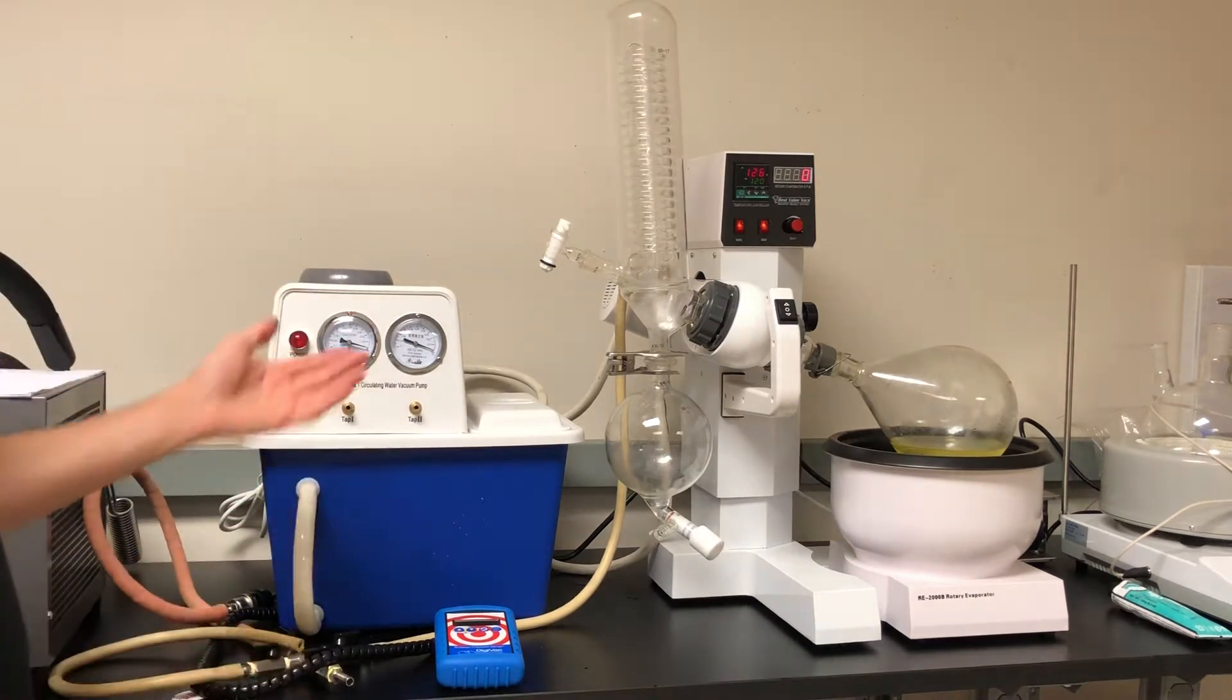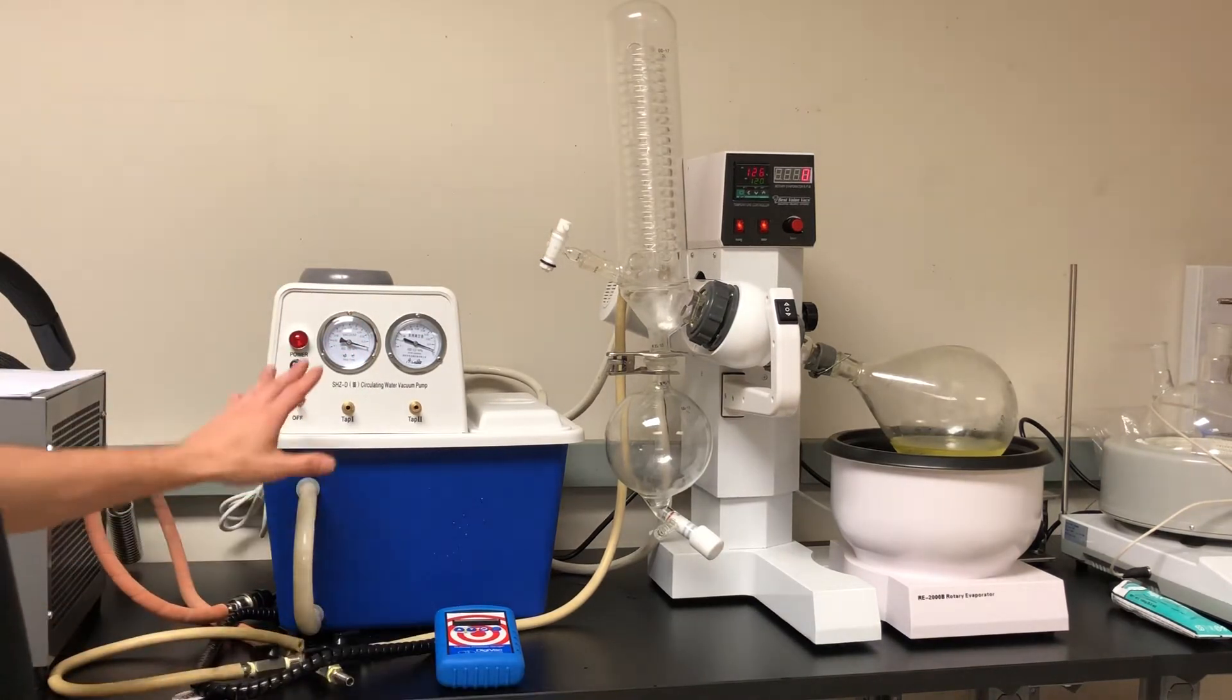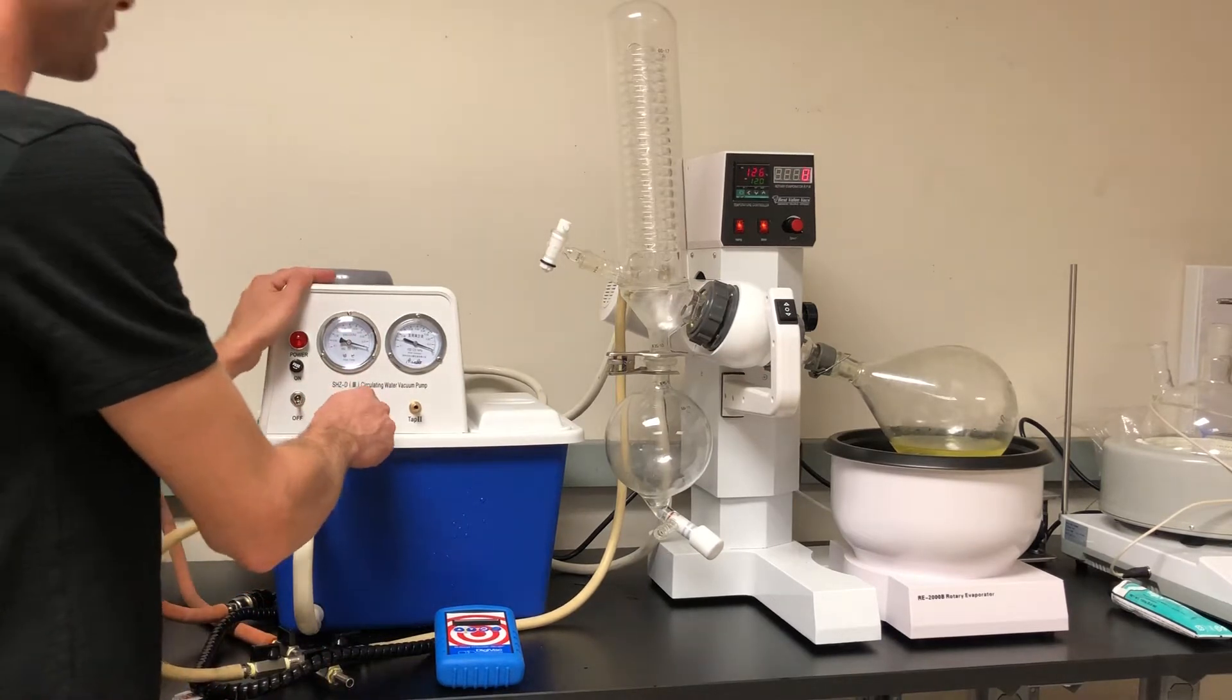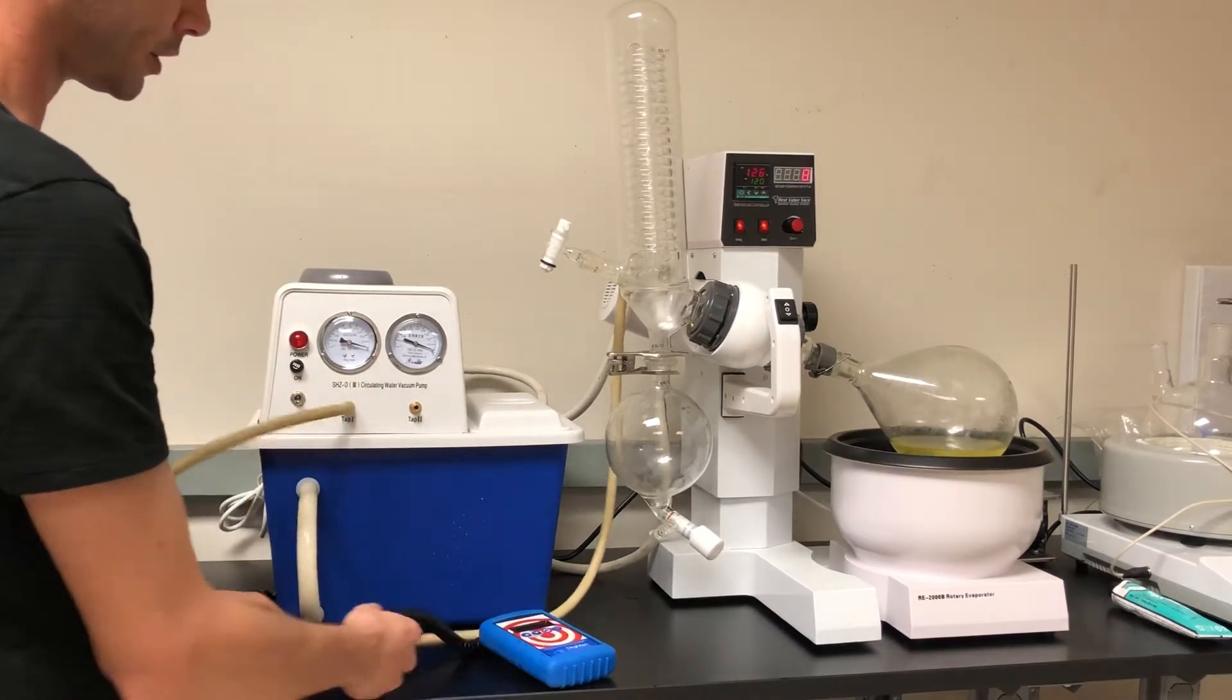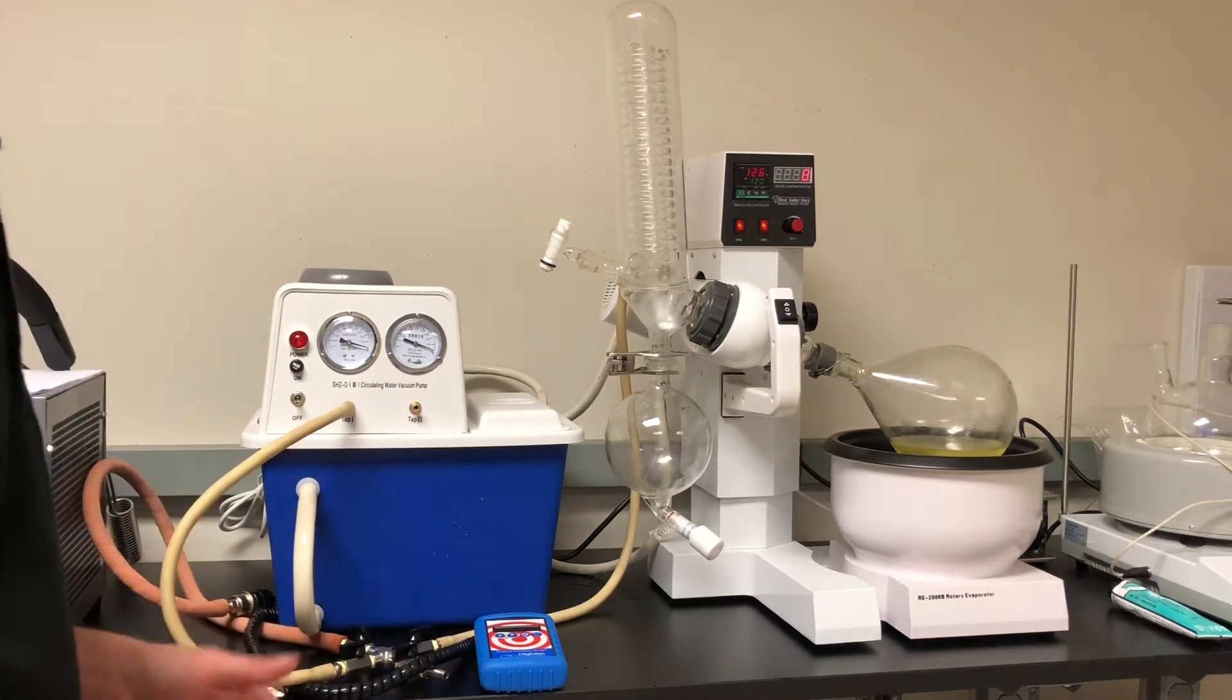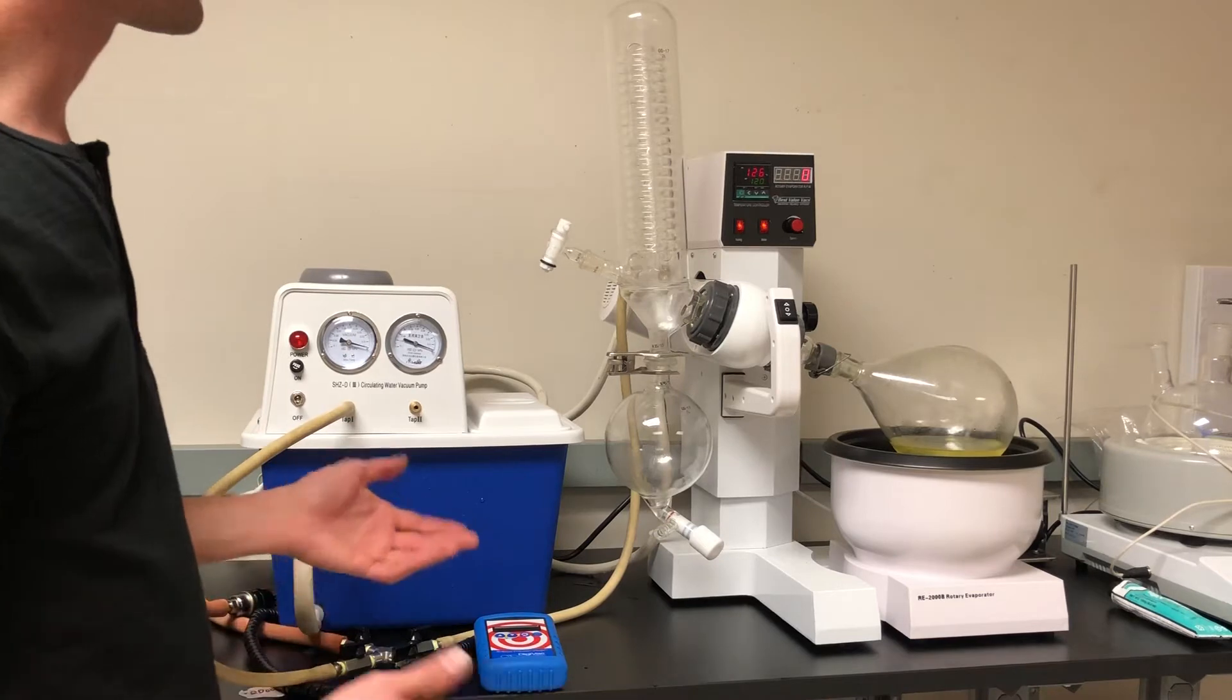The vacuum pump, basically everything is tied into one switch. So it's gonna work as soon as you turn it on, which I can do right now. What I got going on down here is I just created a little manifold so I could read the vacuum pressure in microns. It operates at about 16,000 microns.